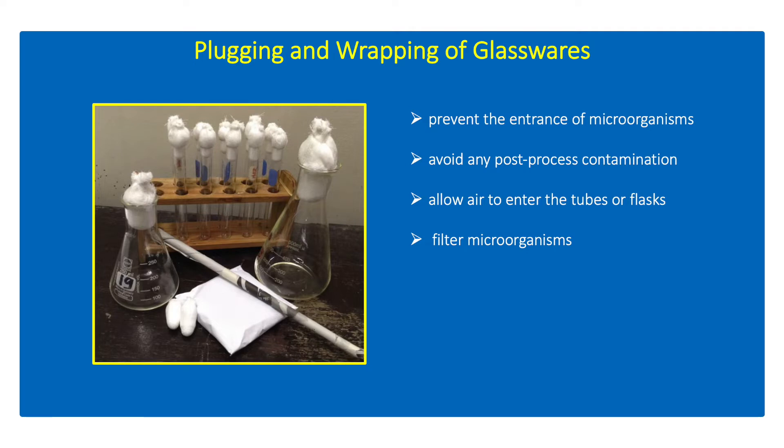Thus, plugging and wrapping of test tubes, flasks, and petriplates will prevent any contaminants from the ambient air or immediate surrounding from contaminating the tools to be used for microbiological analysis. After plugging and wrapping the glasswares, they are then subjected to sterilization.